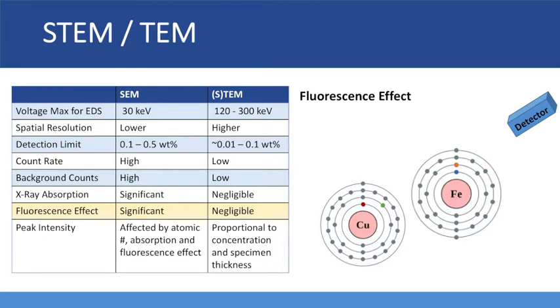However, it's possible that the X-ray fluorescence, also known as secondary X-rays, can be generated from partial energy absorption of the primary X-rays.